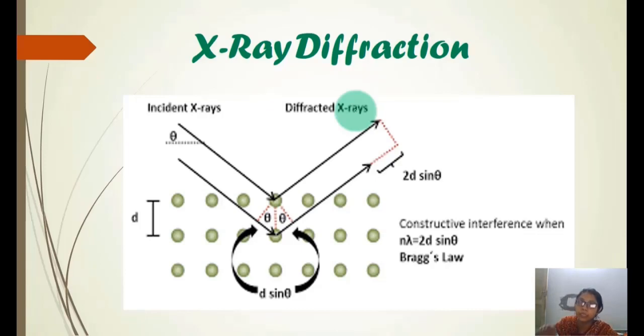That means what will you use there? You must use some other analyzing instrument that is different from that used for the light ray. So for X-ray diffraction we use another detector, which is the Debye camera, which is specially designed to observe the X-ray diffraction pattern. And since X-ray is not visible to you, how would you determine that your light is diffracted? Suppose this is our incident light and this is our diffracted X-ray.